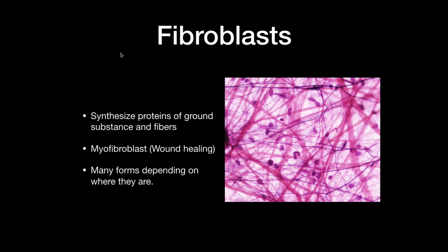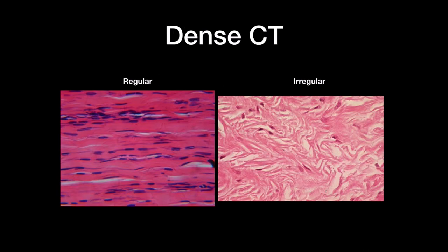In dense connective tissue, fibroblasts are elongated and pressed against the adjacent fibers. Dense connective tissue can be regular or irregular. In regular dense connective tissue, fibers run alongside each other and look organized — you find these in tendons, for example. In irregular dense connective tissue, fibers run in all directions, and these are mostly found in the deep layer of the dermis.